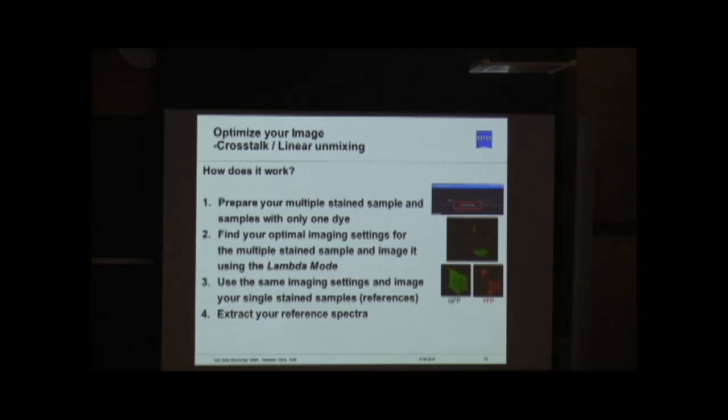Afterwards, just by clicking, I think, two or three times on some buttons in our Zen software, extract your reference spectrum. And once you've extracted the reference spectrum, you have the respective curves for GFP and YFP, you can use this spectrum for unmixing.